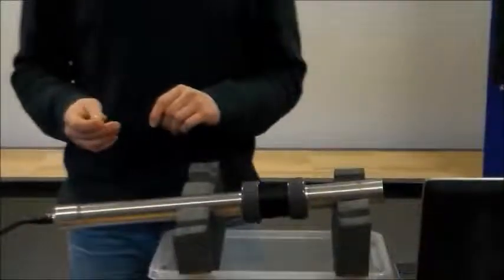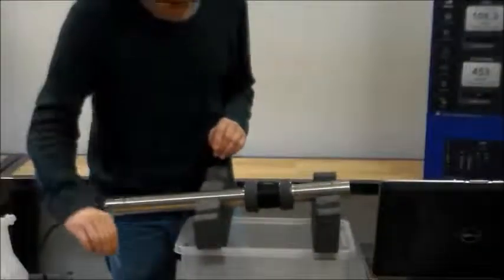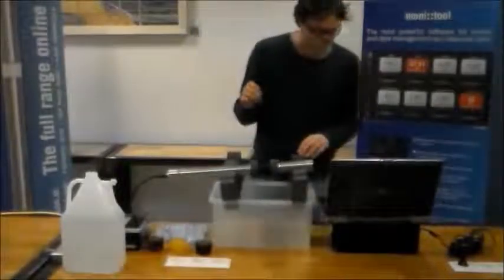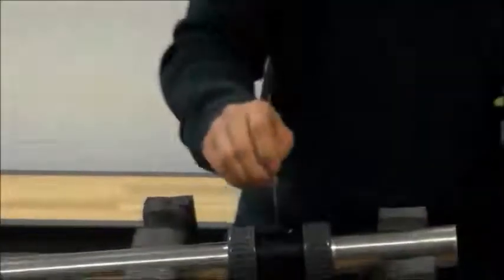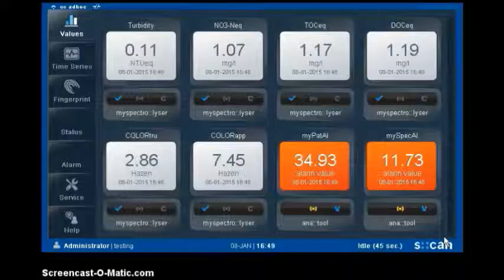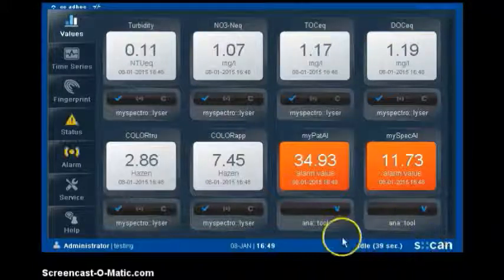So as a next step, I'm going to test the reaction to one of the other substances. I will use the orange juice now, put the drop in, have to stir a bit. So also the orange juice is detected by both algorithms. The reaction is slightly weaker than the reaction to the coffee, but still it is clearly visible and easily detected by both algorithms.